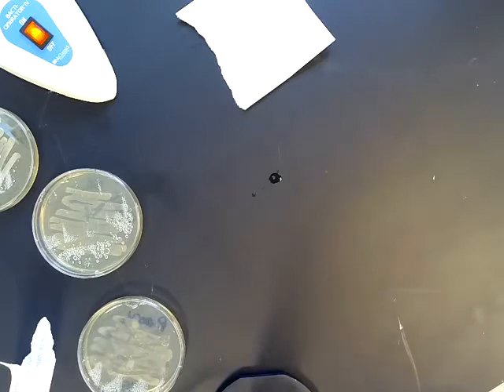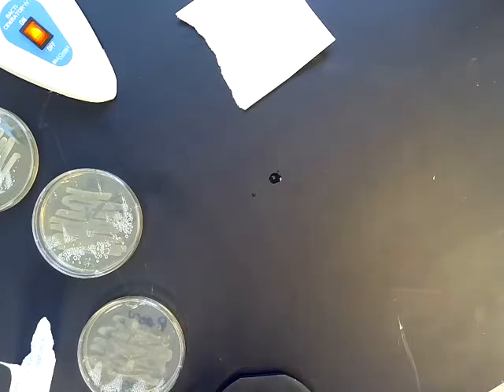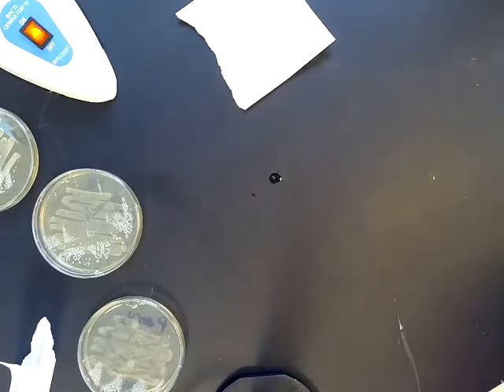And the last one, the C. C is for citrate. Citrate is in the media. If the microorganism can utilize the citrate, it's going to eat all the citrate, and then it's going to start consuming the ammonia in the medium. A base is going to be produced, and that's going to cause a blue color change in the medium.